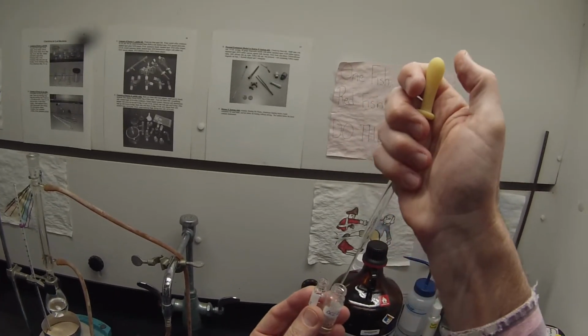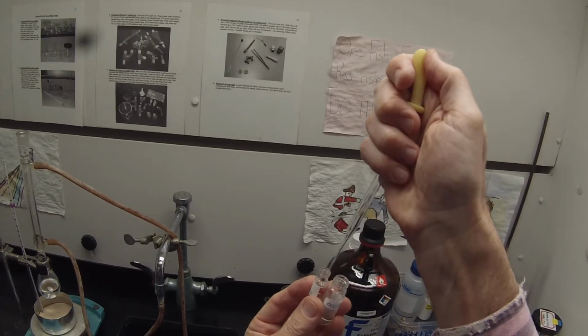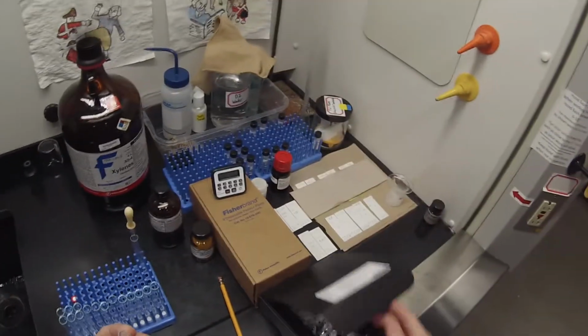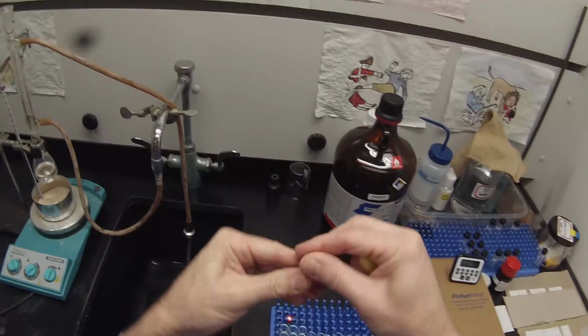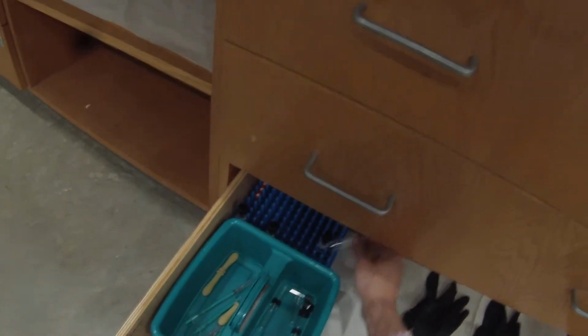So I have a GC mass spec sample of both my crude and purified product before and after column chromatography. It'll give us a good sense of how effective that purification process was. So there's 52A and 52B. You, of course, should be using your own lot numbers, not mine.